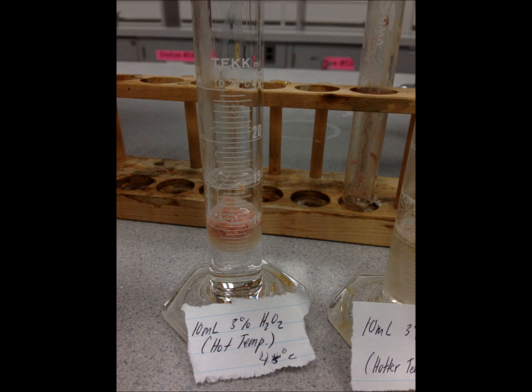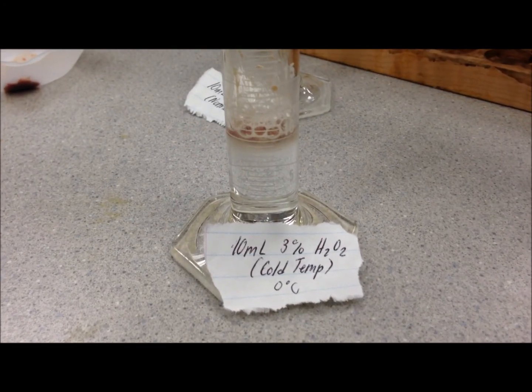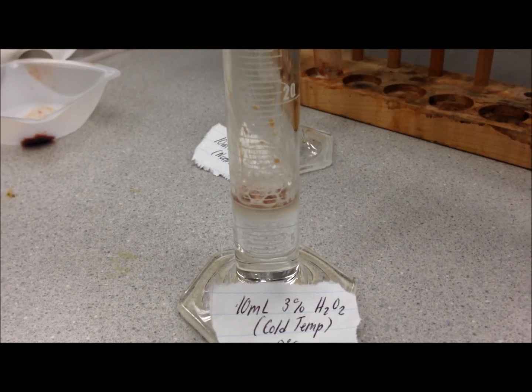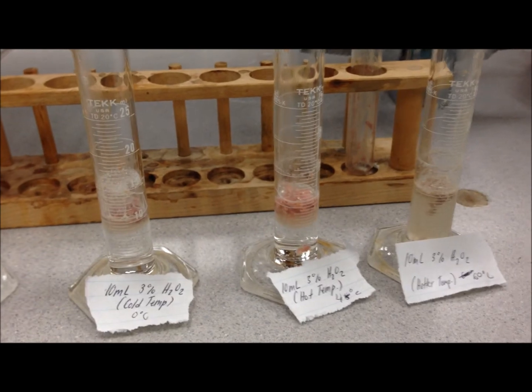For the hottest temperature of liver, which was 60 degrees, it produced 5 milliliters of gas. For the hot temperature, which was 45 degrees, it produced 7 milliliters of O2. For the controlled liver at room temperature, it produced 12 milliliters of O2.